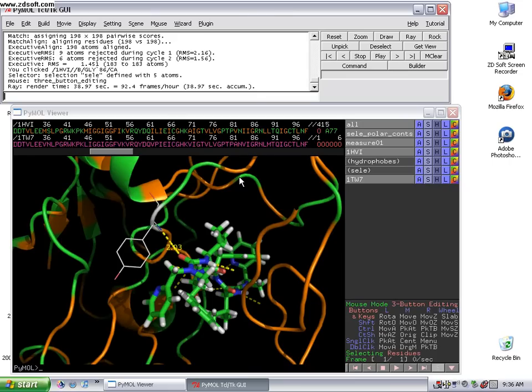You can see it's really brightened things up and makes the structure look a lot better. This is just a really nice tool to make really good images.